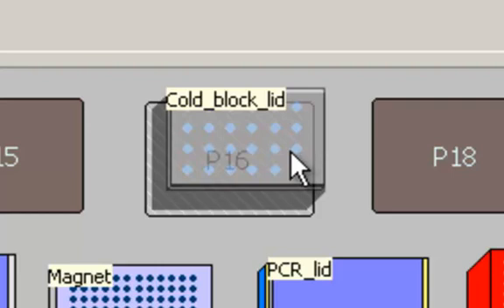Let's take a quick look at the cold block here. Our setup, we use tubes in our cold block. They're either 500 microliter tubes that come in your kit or they're 2 mil tubes. A couple of the reagents, if we're making master mixes, if you're doing a large number of samples, they won't fit in a 500 microliter tube. So we have a mixture there of tubes. Most of them are 500 microliters. There's a couple 2 mil tubes, depending upon what you're processing. And we kind of, on the fly, switch them out. And we'll talk a little more about that when I go over the procedures.